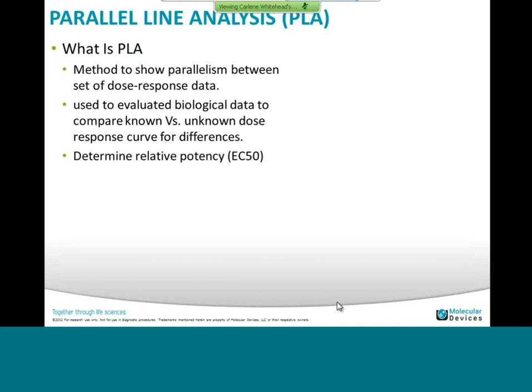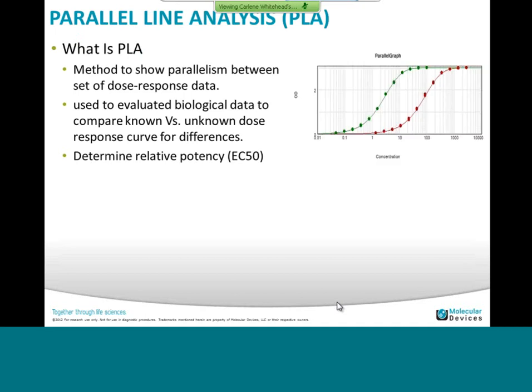So now we have covered weighting. We will move on to parallel line analysis, or PLA. So what is PLA? PLA is a method to show parallelism between sets of dose response data. It will be used to evaluate biological data, to compare a known curve versus an unknown dose response curve and look for the differences. This will also help you to determine the relative potency.